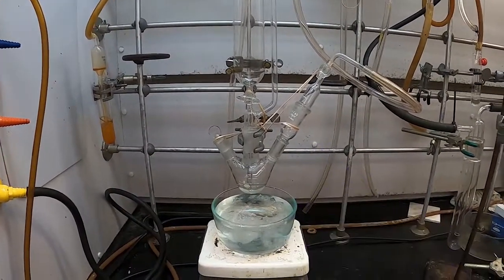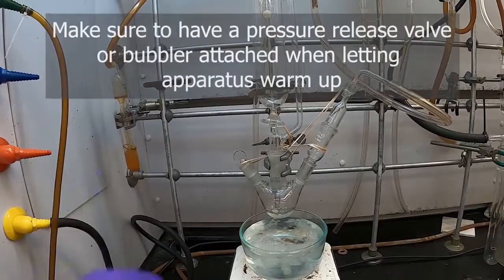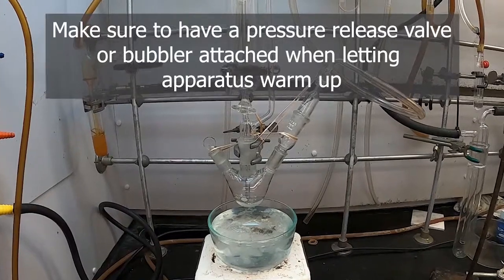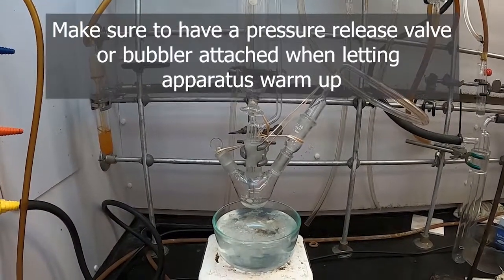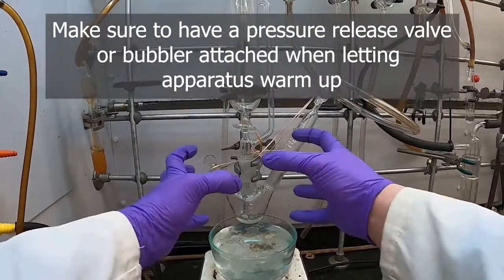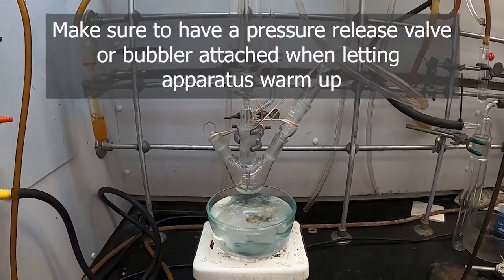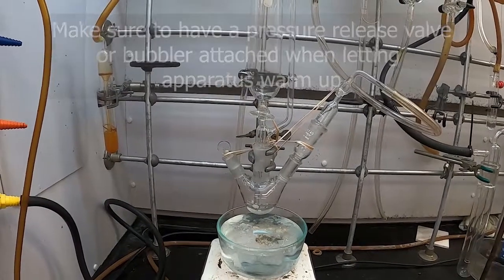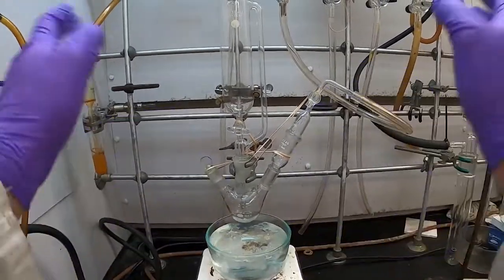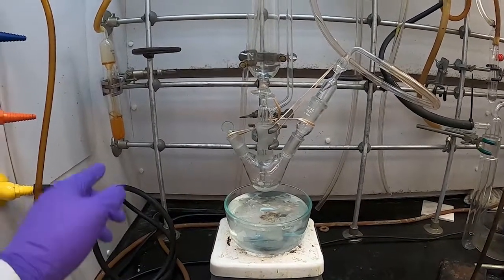It's also worth noting that once you've lowered your bath to allow your apparatus to warm back up, you should make sure that your bubbler is still on, or turned back on, until your reaction is over, so that as your apparatus warms up, you don't have joints come apart as the gases inside expand. They might push on your joints. That way you have a relief valve for any changes in the gas pressure within your apparatus. That's another reason why rubber bands are important, to prevent glassware pieces from flying away if you forget something like that, or if pressure gets too high for even your bubbler to manage.